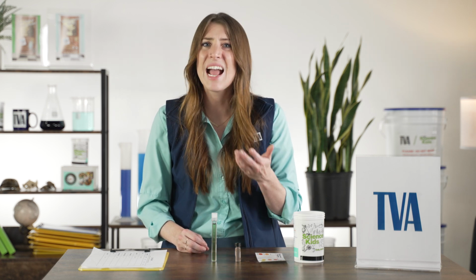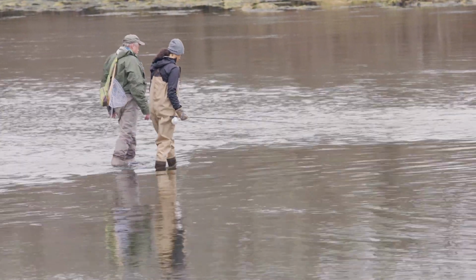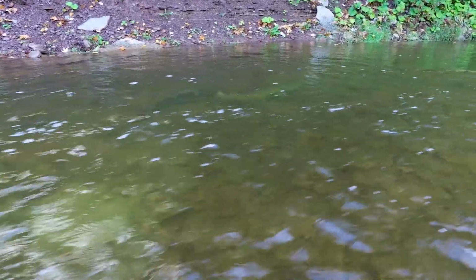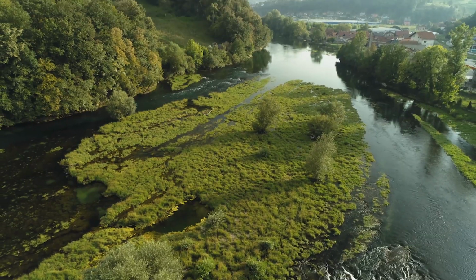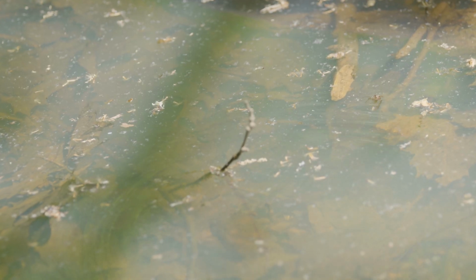And finally, turbidity. You should have recorded your Secchi disk between 0 to 100 JTU. This is the one that can be kind of misleading to interpret because we want to say that the clearer the water it is, the healthier it is, but that's not always the case. In West Tennessee and Mississippi, we have pretty muddy rivers compared to the cold, clear streams in East Tennessee, Georgia, and North Carolina. Our aquatic life have adapted to a certain amount of turbidity, and sometimes that suspended matter is a food source that our filter feeders eat.